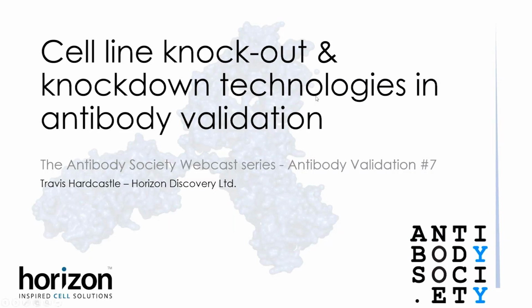Hi, Simon. Thank you so much for inviting me to give this talk today at the Antibody Society, and thank you for having us on here and thinking of Horizon to talk about this subject. So what I really wanted to talk about today is cell line knockouts and knockdown technologies and how they can be used for antibody validation studies.